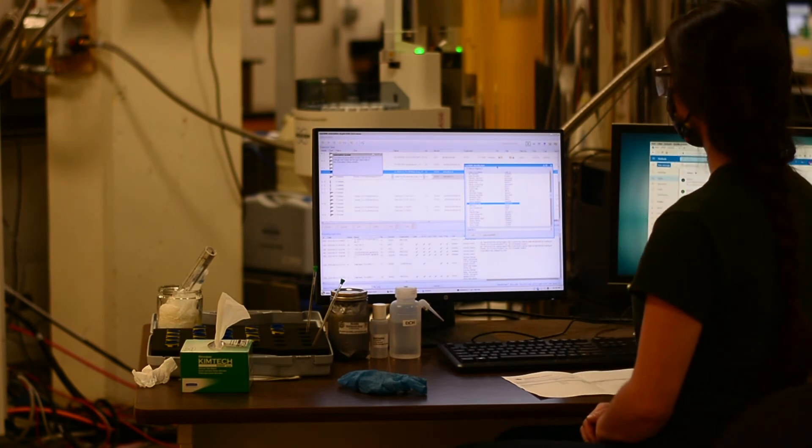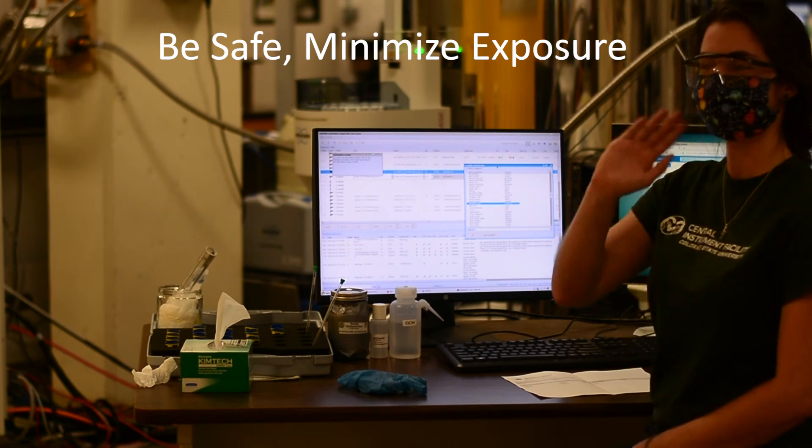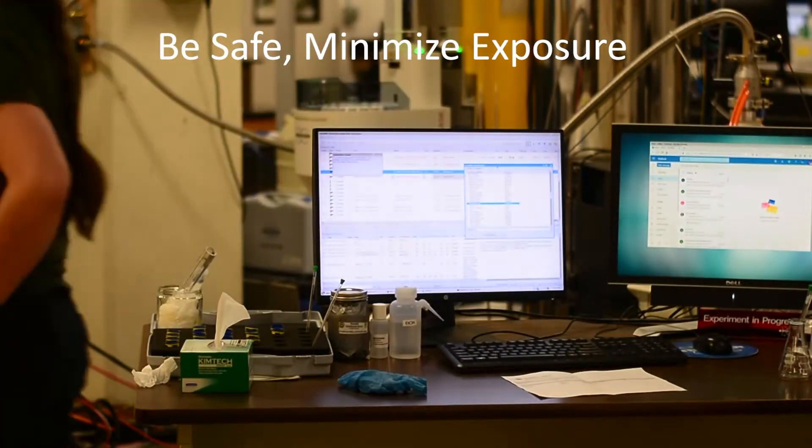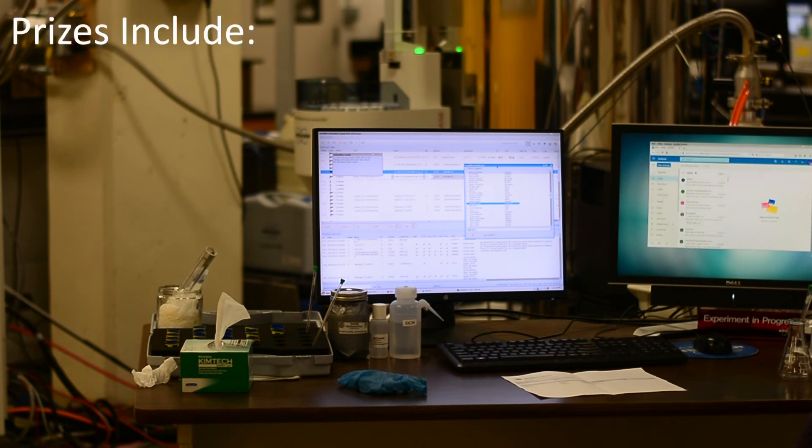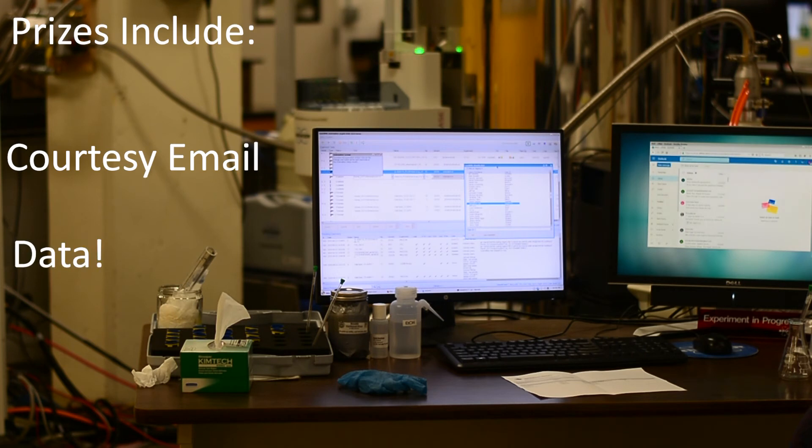Once your samples are queued you can leave the lab and you'll receive an email that contains your notification that your sample has been completed as well as your data in both an integrated and peak picked PDF as well as the FID file.